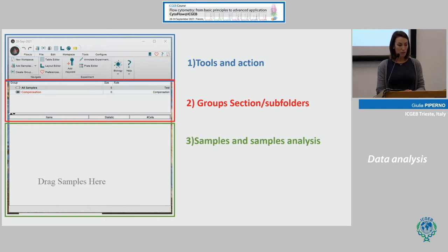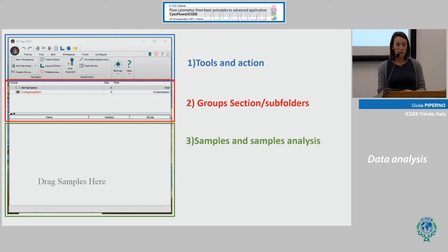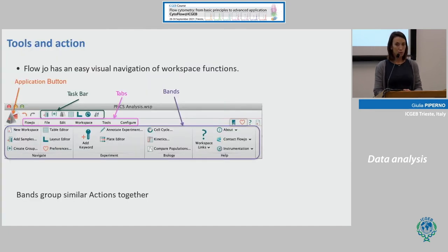The workspace is divided in three sections. The first, upper one is Tools and Action, where you can find different tabs and buttons. The middle one is the Group section with subfolders, where you can organize your groups. The last, lower one is where you put your samples and start to analyze them.